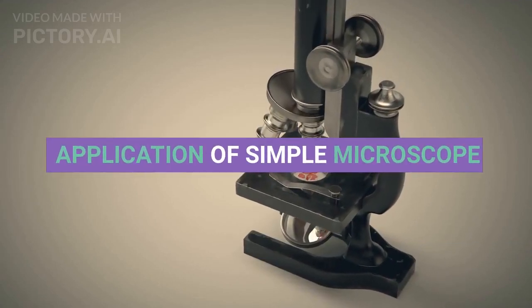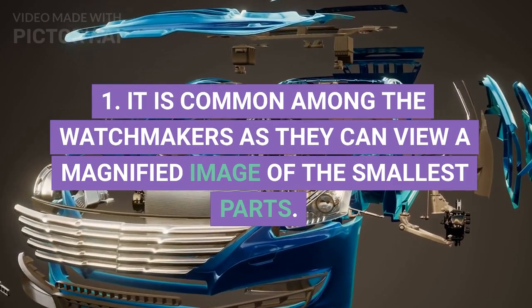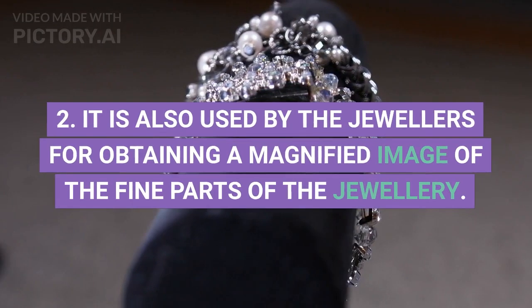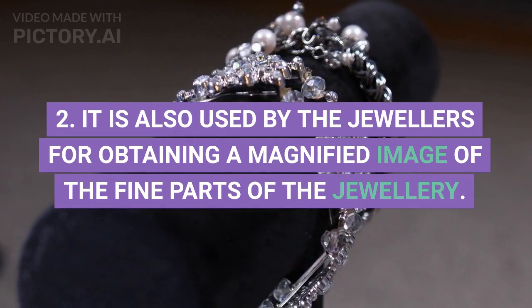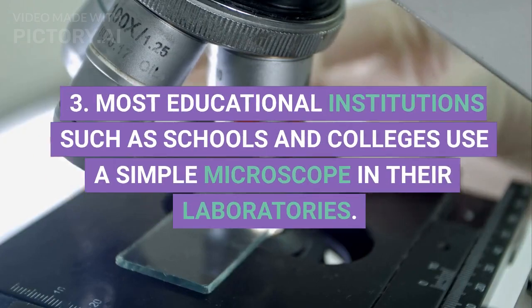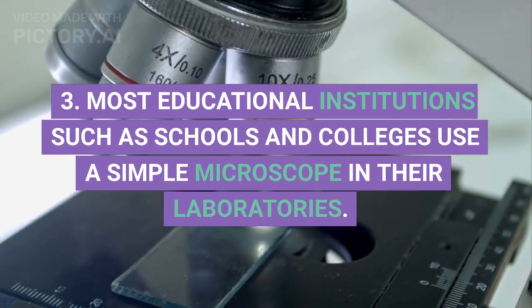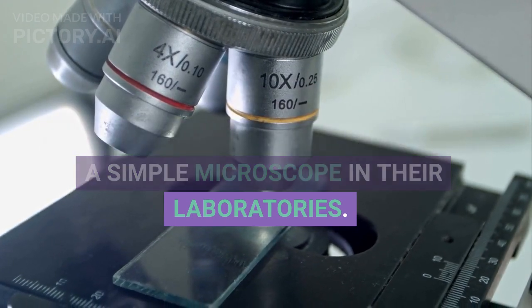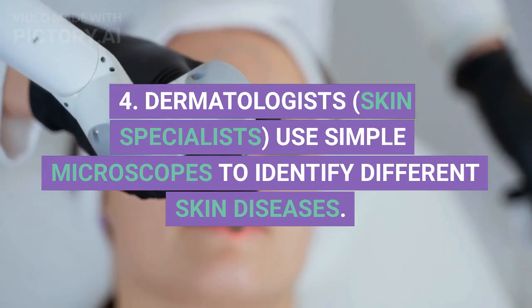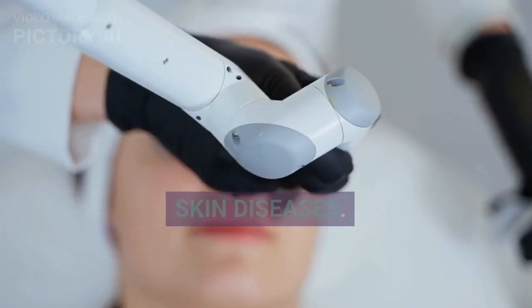Application of simple microscope. 1. It is common among the watchmakers as they can view a magnified image of the smallest parts. 2. It is also used by the jewelers for obtaining a magnified image of the fine parts of the jewelry. 3. Most educational institutions such as schools and colleges use a simple microscope in their laboratories. 4. Dermatologists, skin specialists, use simple microscopes to identify different skin diseases.